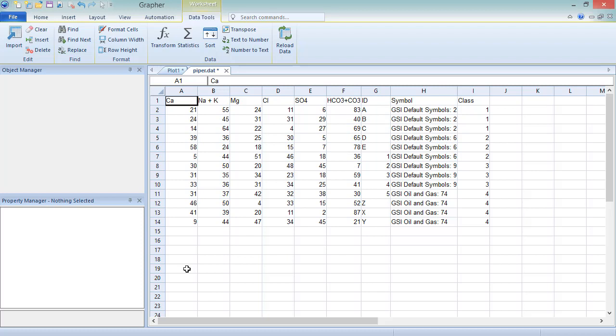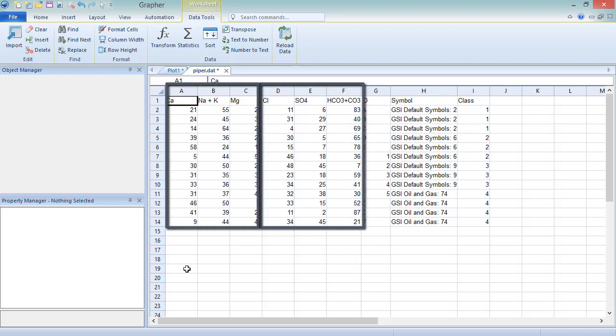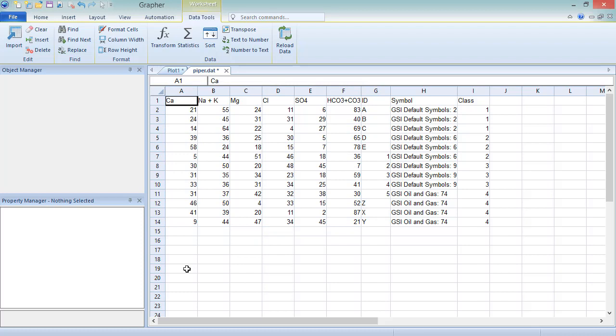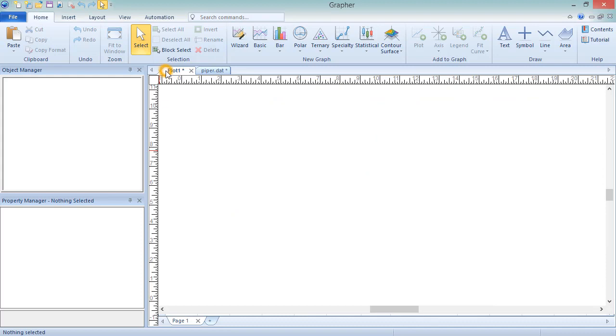Piper plots are created from two ternary diagrams depicting the normalized milliequivalent percentages of anions and cations, and a central diamond plot created by projecting the points from the two ternary diagrams parallel to their interior axis until they meet.